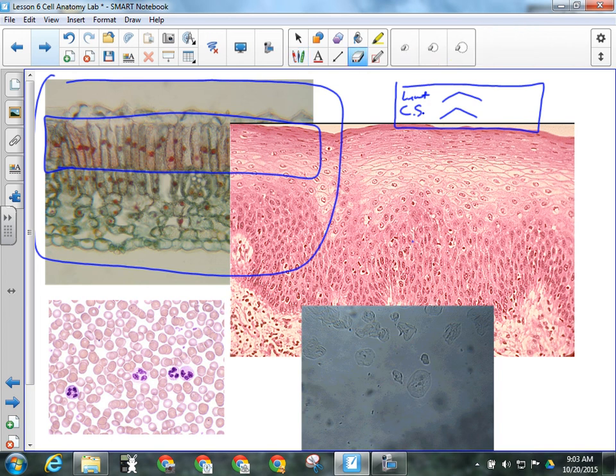Right now, if you look closely at this, you can sort of see that there are some darker structures in there. Yours will be a little clearer than this one is. It also looks as though the nucleus has a bit of a beard, okay, on this edge of it. And we said that sometimes there's a certain structure that's attached to the nucleus. Okay, so look at this and look at it discerningly.